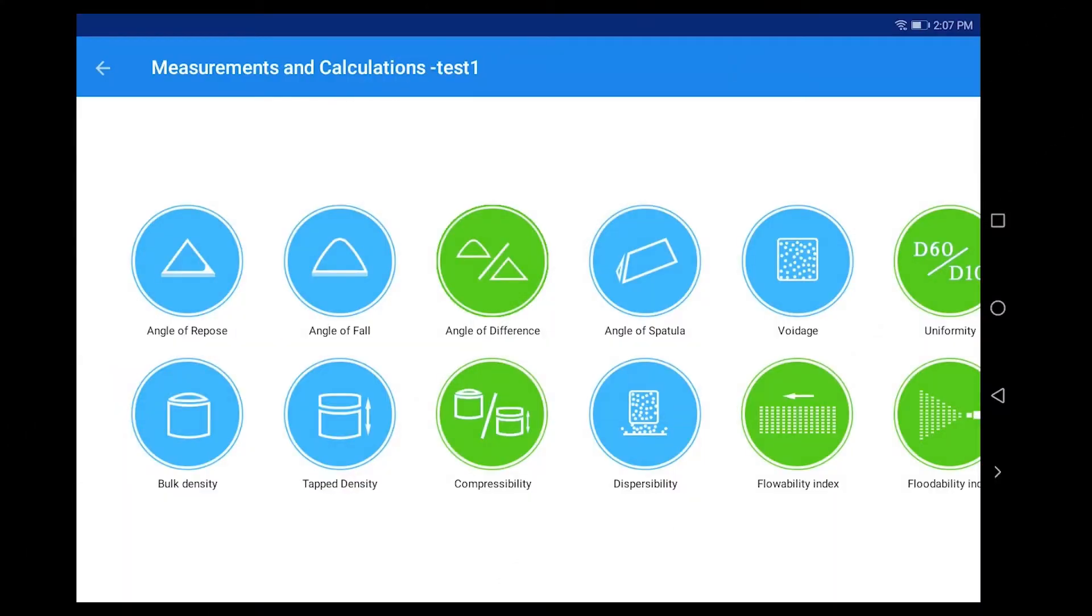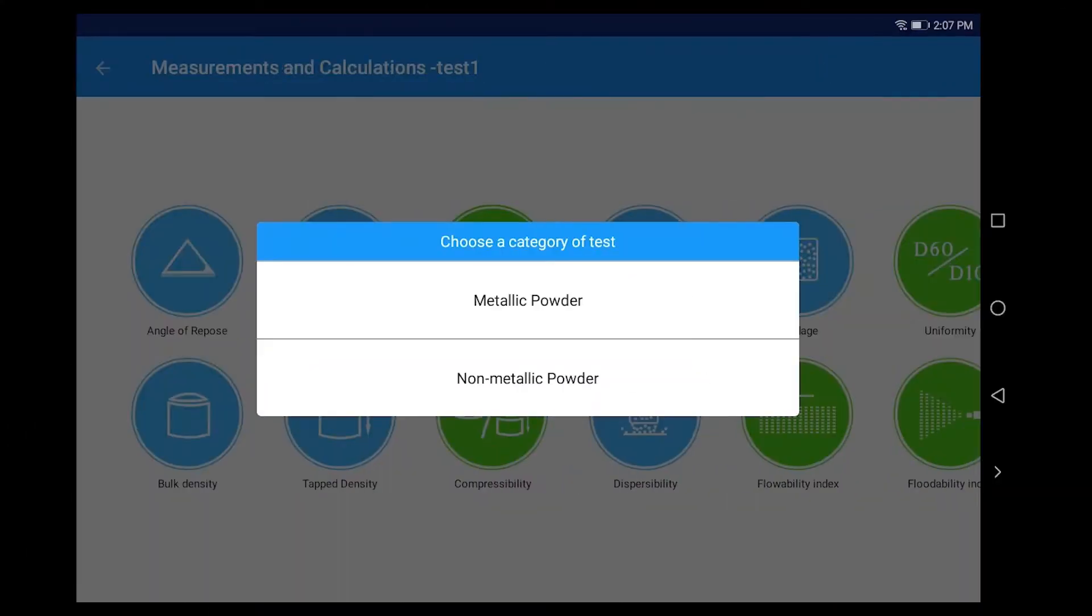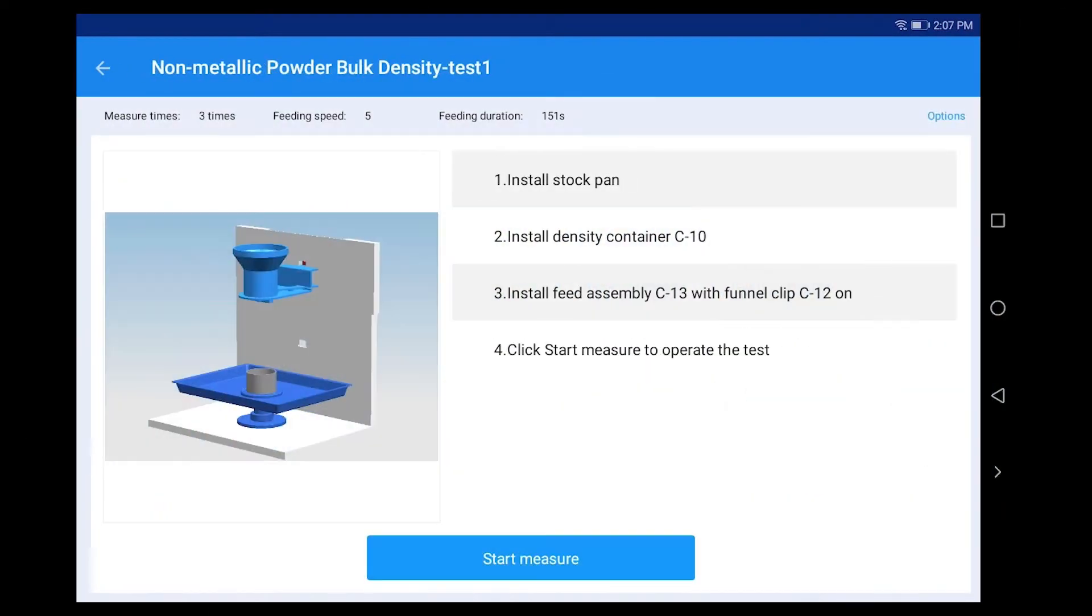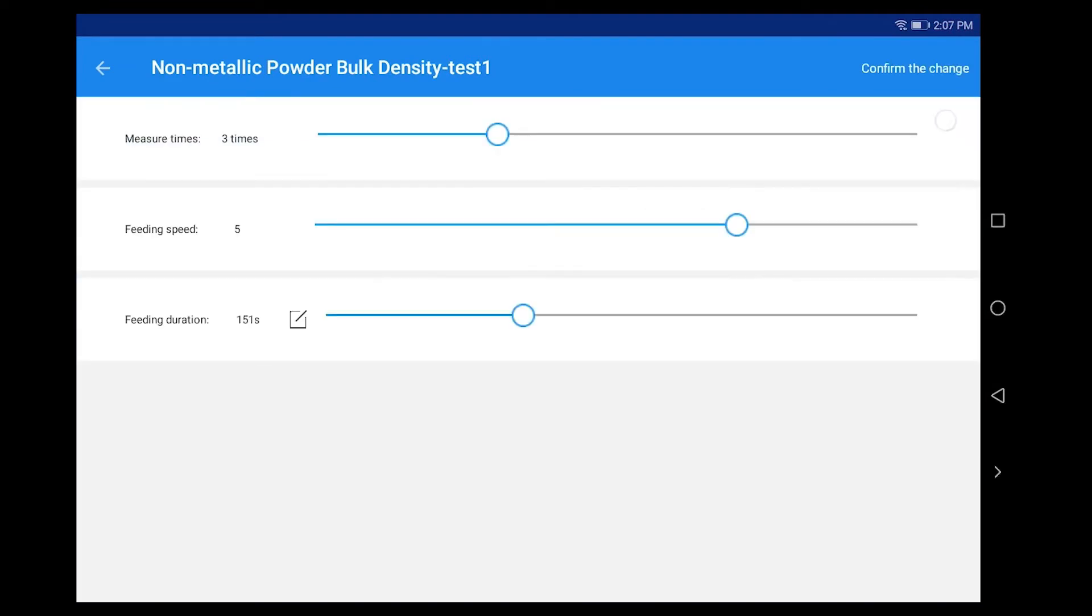Click Bulk Density. Click Non-Metallic Powder. Click Options. Set Measure Times, Feeding Speed, and Feeding Time as required.